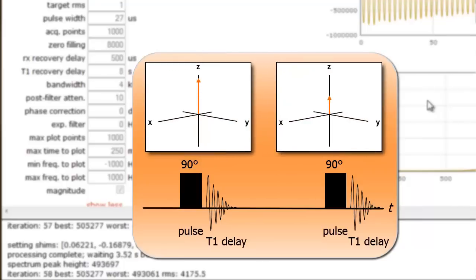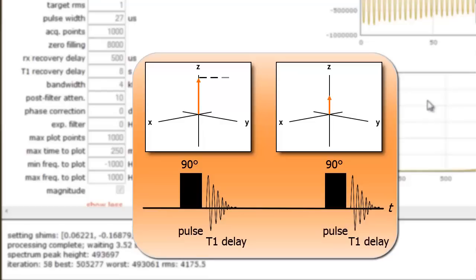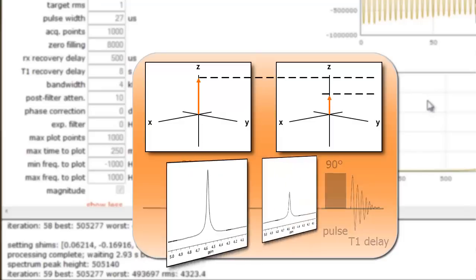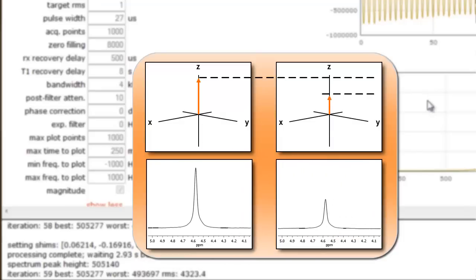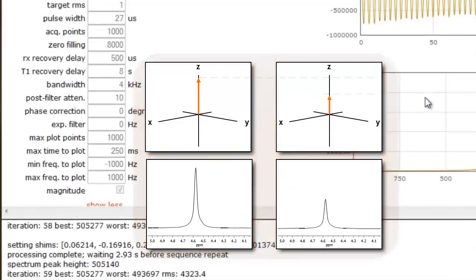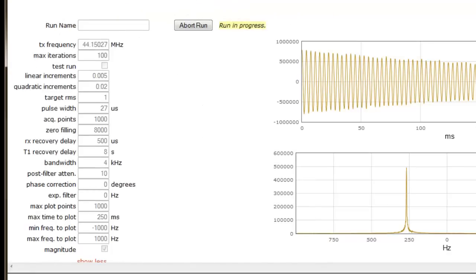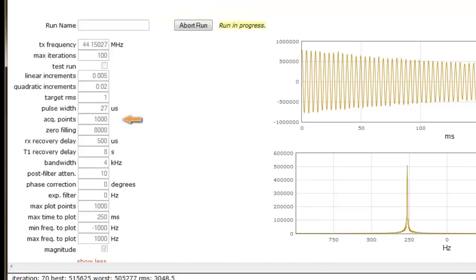If a process time extension occurs, the excited protons will have relaxed further, and the signal intensity will potentially be larger and not comparable to other pulses. Processing time is affected by the number of points we acquire, by the maximum time to plot and by the maximum points to plot parameters.